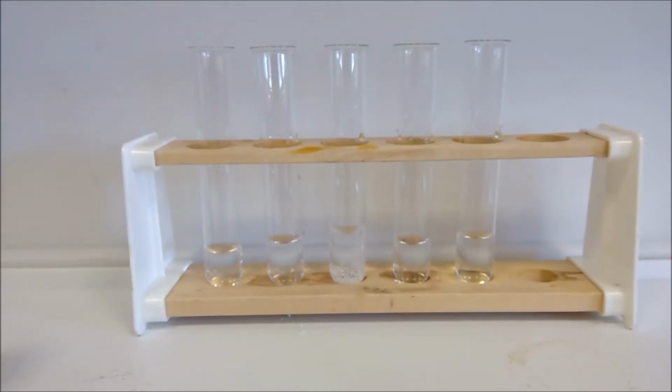Okay, so from adding our nitric acid, we are actually in a position to positively identify one of our anions at the moment. So our next test is then to finish off the halide ion test by adding silver nitrate. Now we'll only do that to the ones that we know are not carbonate ions, otherwise that could result in us getting a false positive result.